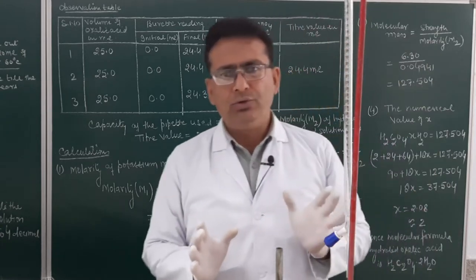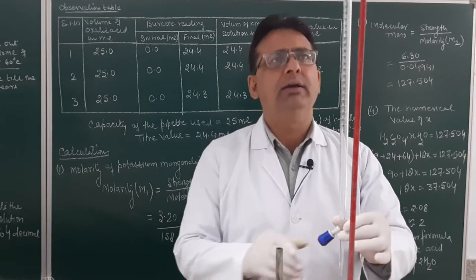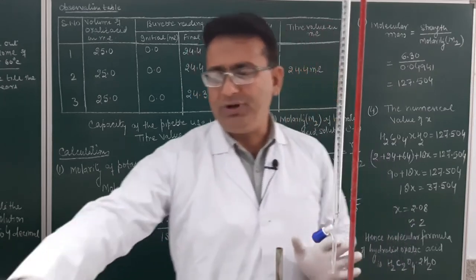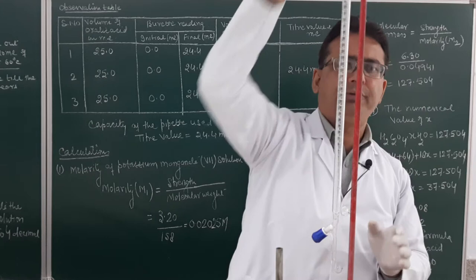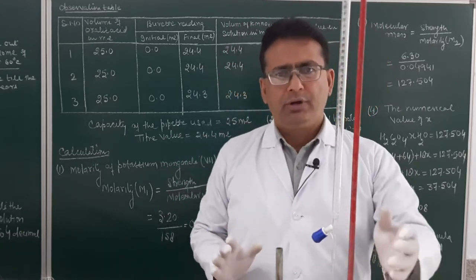Now what will I do? I will fill the burette with a KMnO4 solution. How is it to be done? You may see over here, I will put the funnel over it. Fine. Is it clear or not?